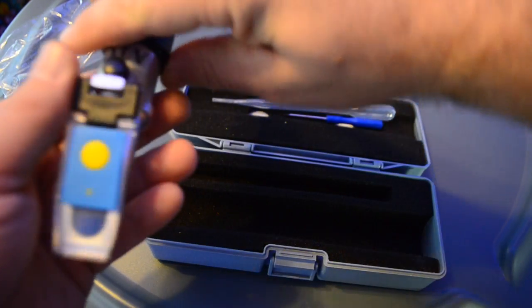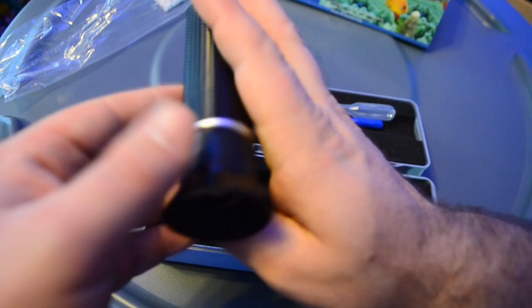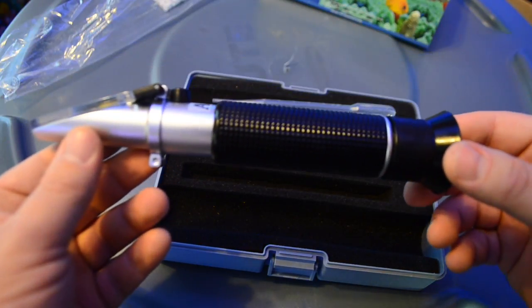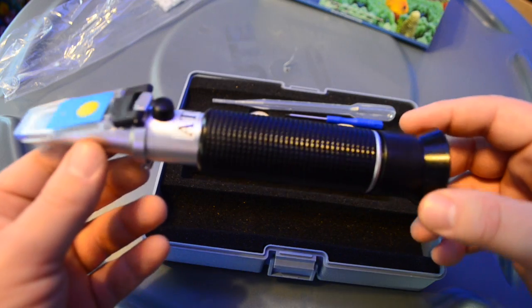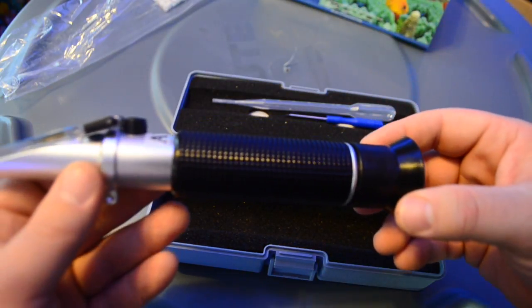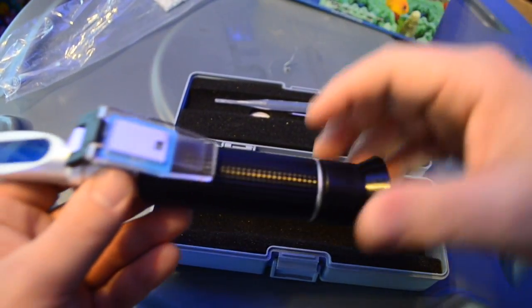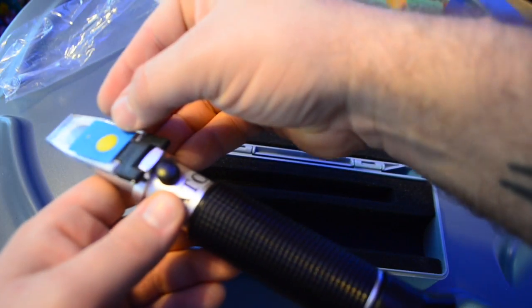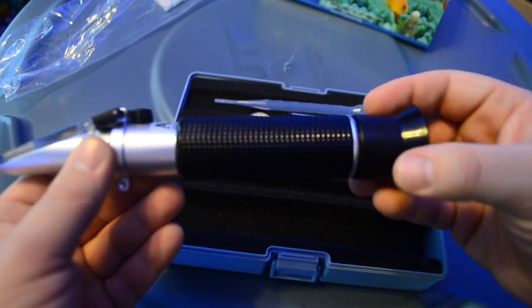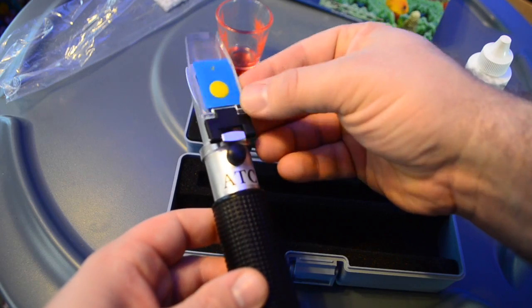As you can see it's pretty different compared to other refractometers — it's pretty light in the hand and has a good grip. The idea behind this is that you can read your salinity or specific gravity in the dark. You don't actually have to go looking for a light source at all. So let's say it's night time and you're doing some water changes or trying to get your barrel to the correct salinity — it has an LED right there installed, which is pretty awesome. I've got some calibration fluid here and we're going to go ahead and calibrate this refractometer.